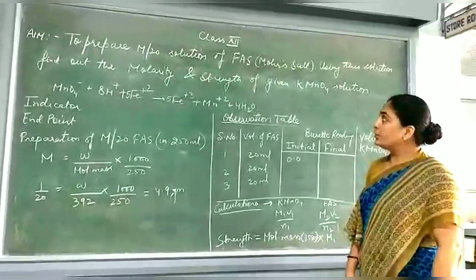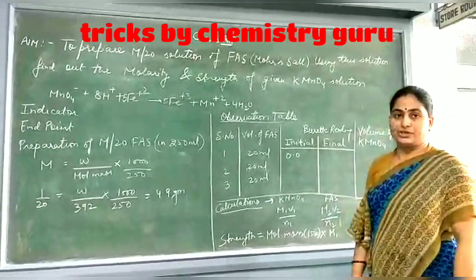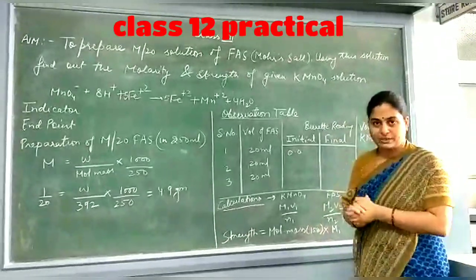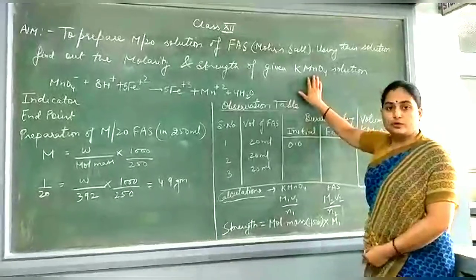Good morning students. Today we have the class 12th practical, and the practical is all about titration. In 11th class you have studied about neutralization titration, where we reacted an acid with a base. In 12th we have redox titration because we are basically using KMnO4 solution.